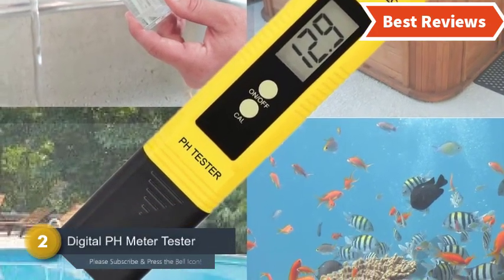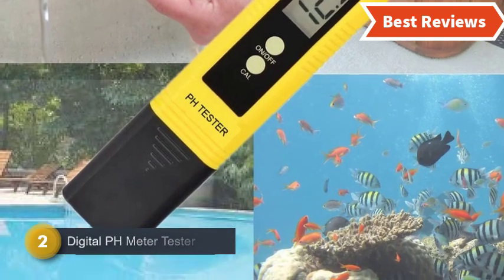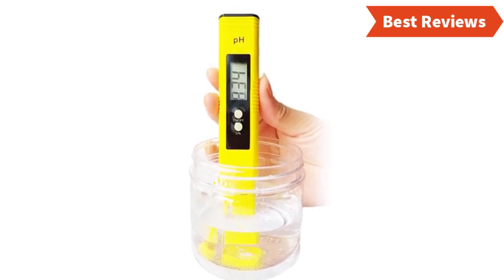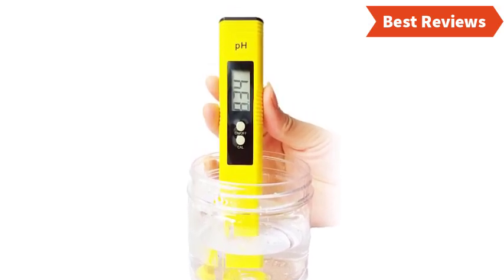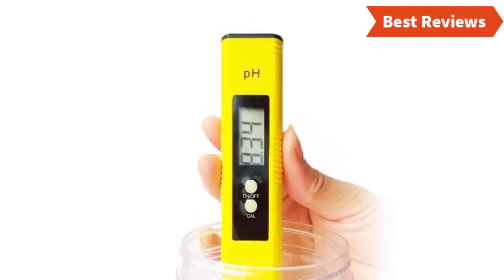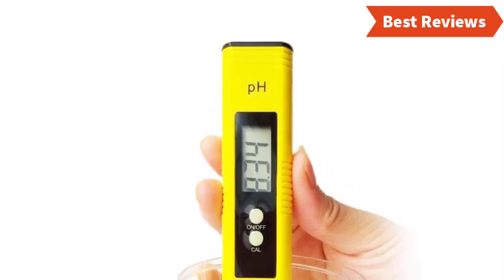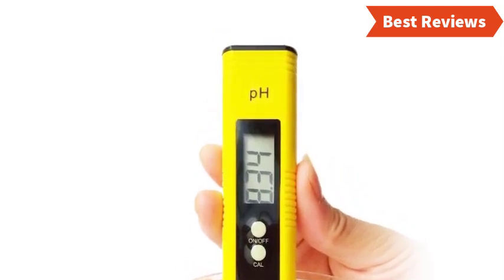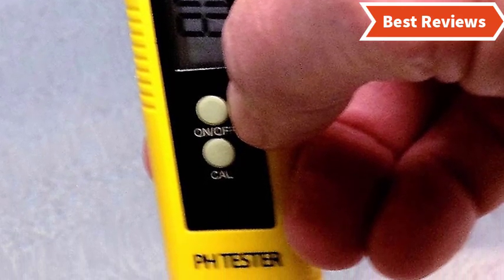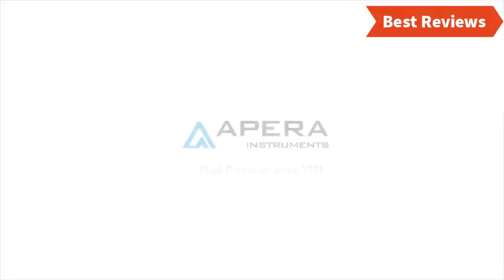Number two on our list is the Digital pH Meter Tester, which features versatile functions to make different testing easier. It has been designed for easy one-touch reading and provides measurement with ±0.05 pH tolerance, delivering quick results. The auto calibration includes buffer powder. This pH meter is a great choice for kids using it in school for science experiments, and it's an excellent tool for monitoring aquariums, pools, and spas. Using it is very easy — just turn it on, insert it into the liquid, and read the result.